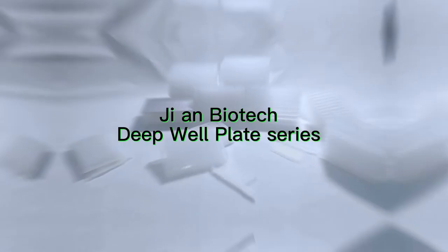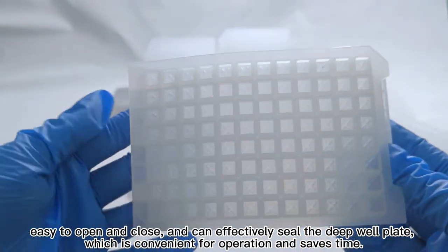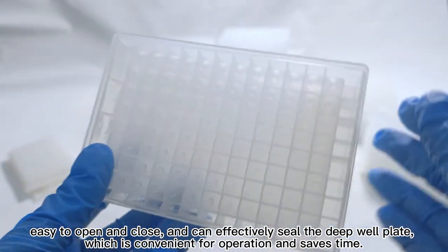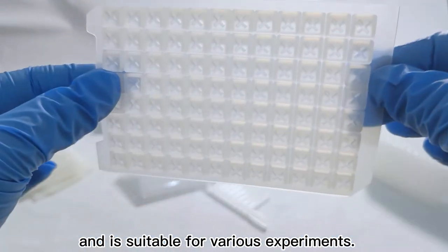Ji an Biotech Deep Well Plate Series. Easy to open and close, and can effectively seal the deep well plate, which is convenient for operation and saves time. With a wide temperature range of -50°C to 200°C, it is suitable for various experiments.